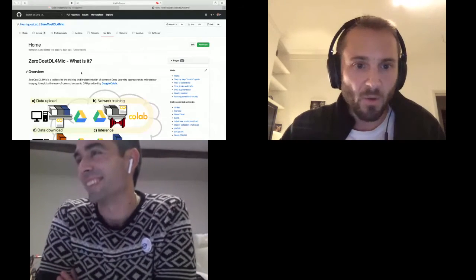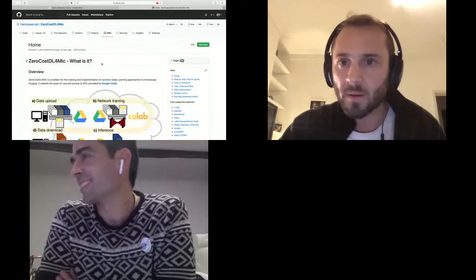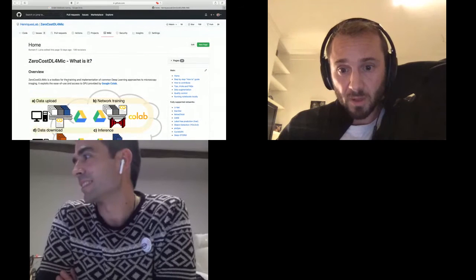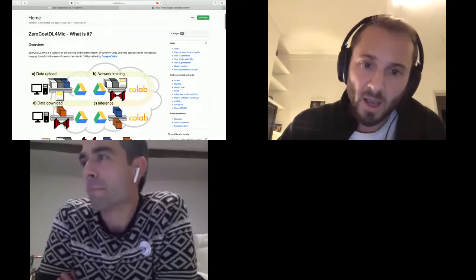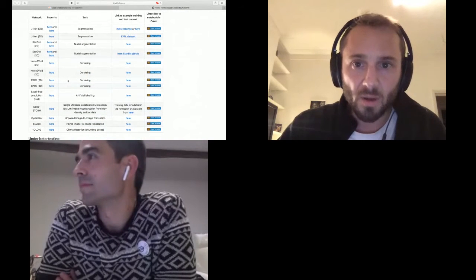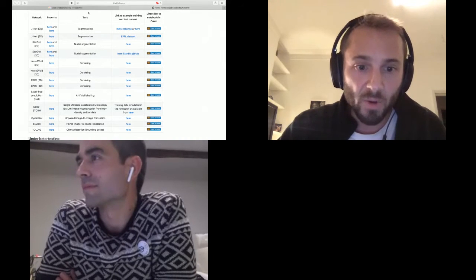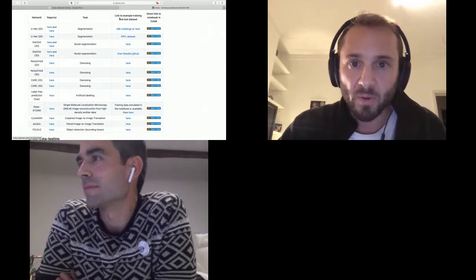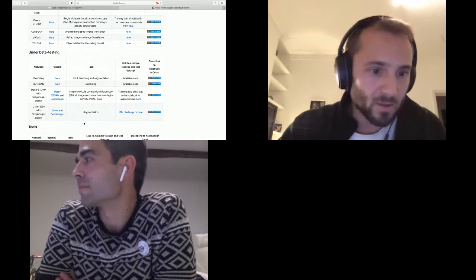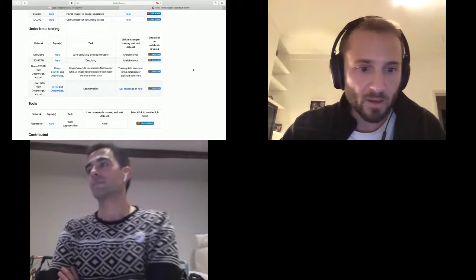Okay, so demo time. Here we go. What we've got here is our GitHub website, which is completely open source, and we'll share all the code for all of those things. We've made this as user-friendly as possible. If you go on our GitHub page, you'll see a whole list of different networks, for which different tasks are possible, and the corresponding dataset and so on.